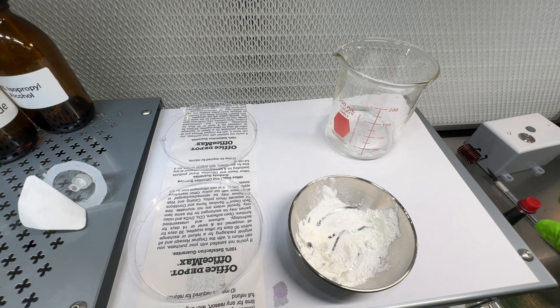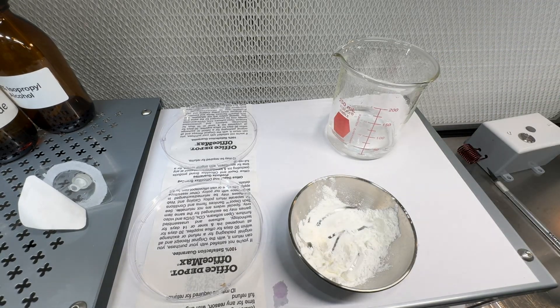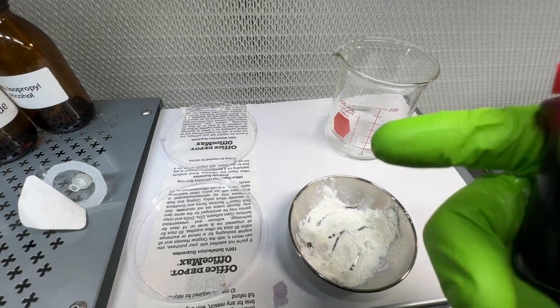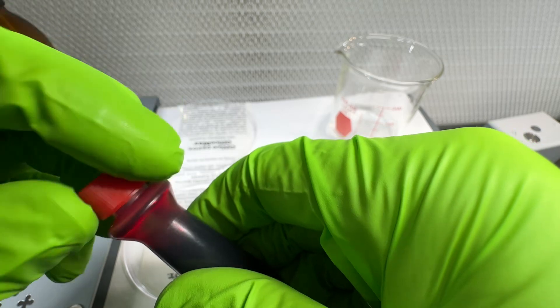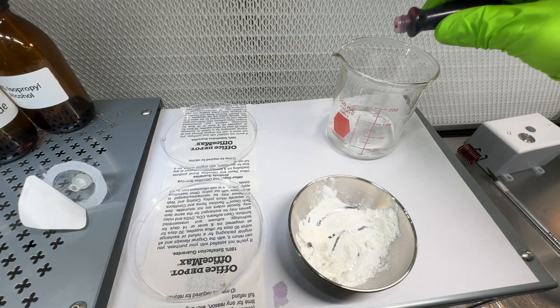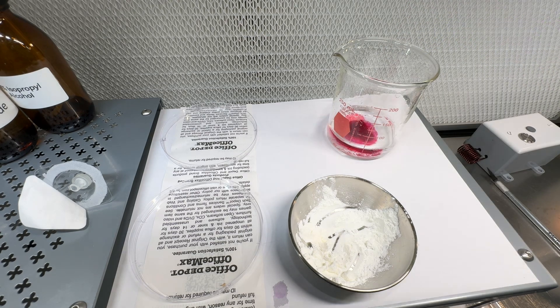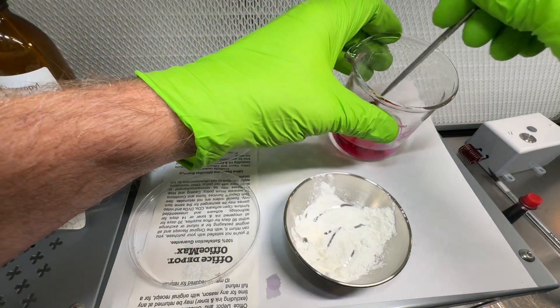What happens to the peptides? In our last experiment we used some activated charcoal, mixed it in with distilled water, and made a black solution turn clear again. This time we want to use some red food dye, which is molecularly about the same size as a peptide.